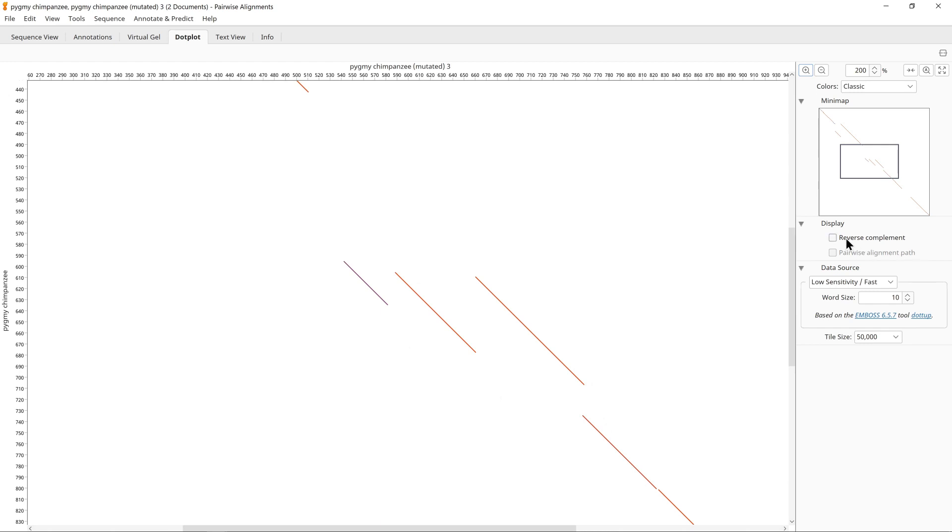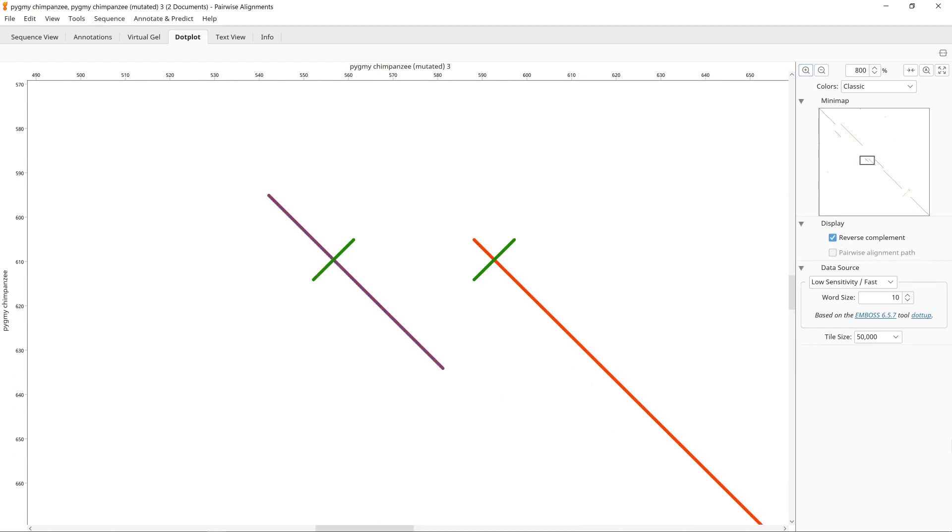Now check the box next to reverse complement to also compare the first sequence with the reverse complement of the second sequence. This will potentially create diagonal lines which move from top right to bottom left. A reversed diagonal indicates a sequence inversion event. This means that one sequence has to match against the reverse complement of another sequence.